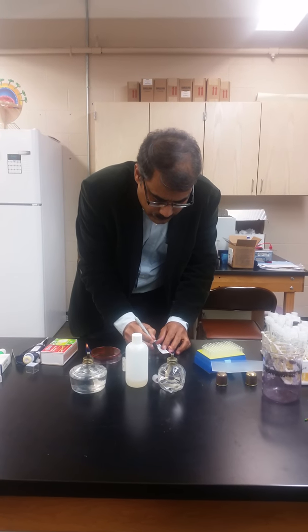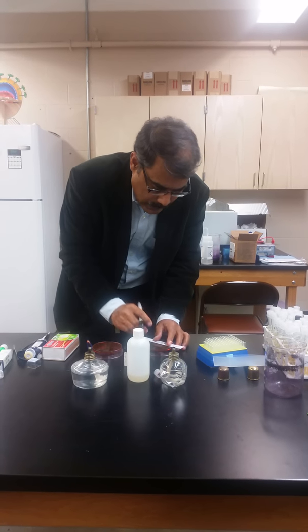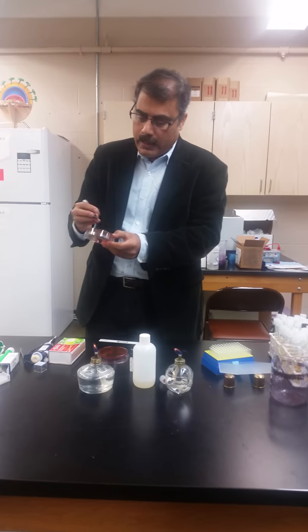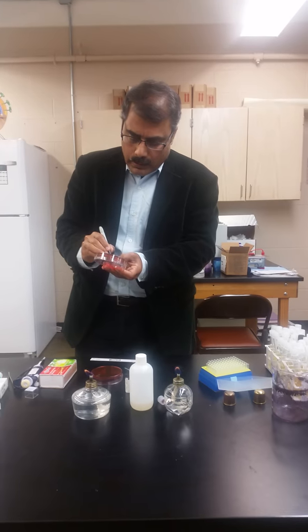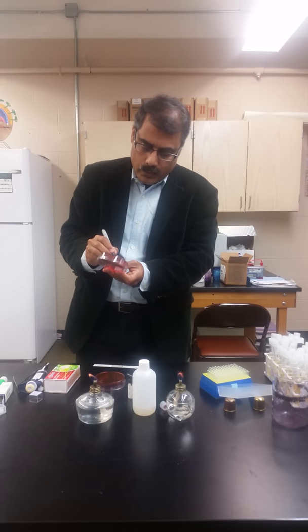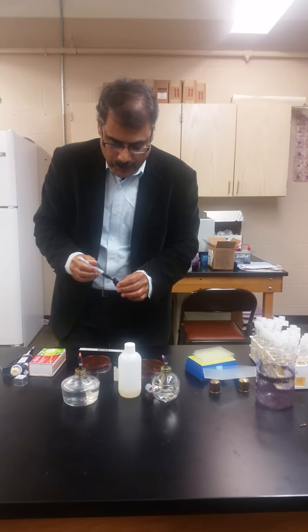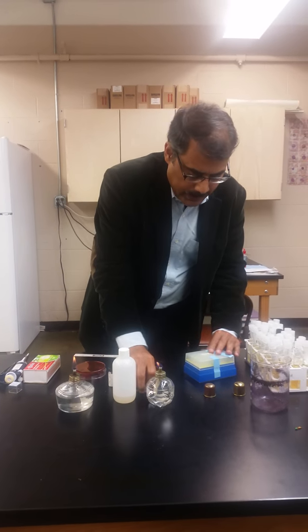So I use it most of the time so that I'm oriented whenever I'm observing these. So you have 4 quadrants, you put numbers here. One of them would be a control, so I'll put C here, and the rest of them will be antibiotics on it.